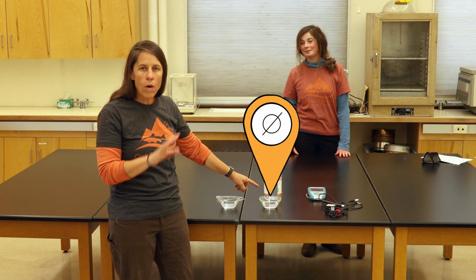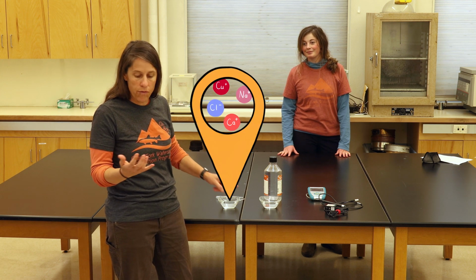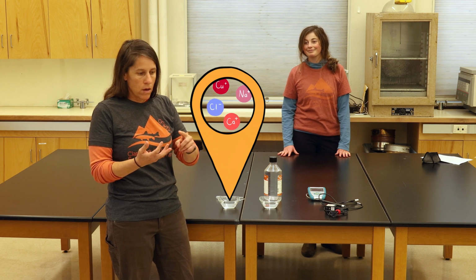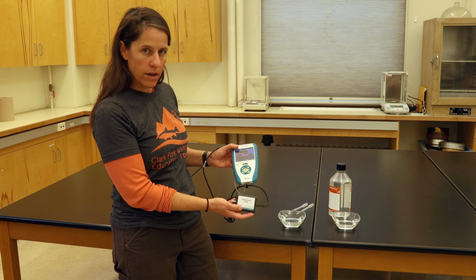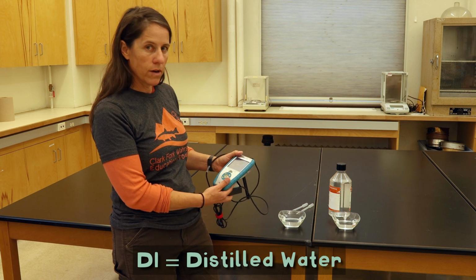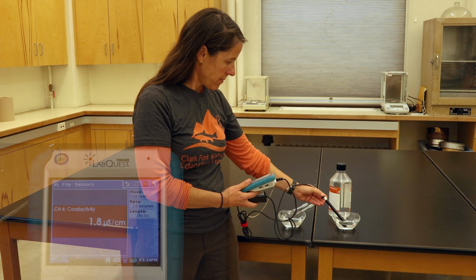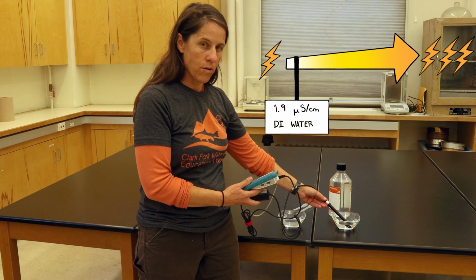So the first couple solutions we're going to look at is distilled water, which is basically purified water, no ions in it, no minerals. And then tap water that does have some minerals, some that we need for sustaining life: sodium, chloride, calcium, and even copper. So here's a LabQuest and a conductivity probe attached to it. And so we'll test the DI water to see what the conductivity is. 1.9 microsiemens per centimeter is the DI water, very low conductivity.